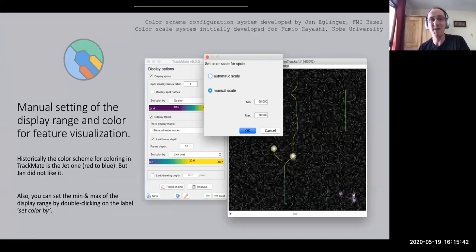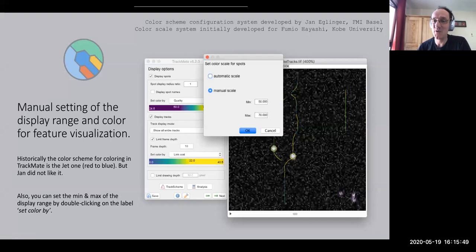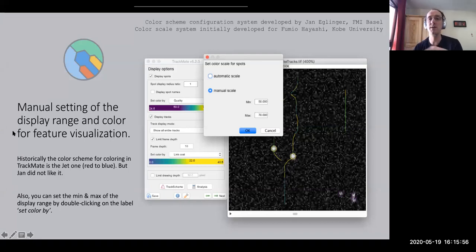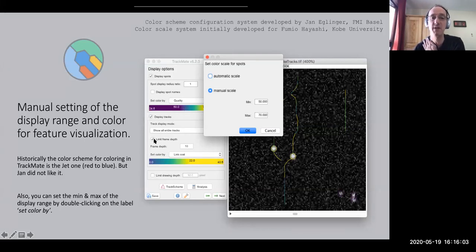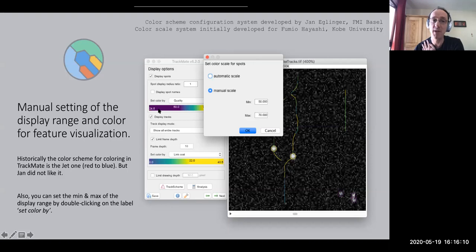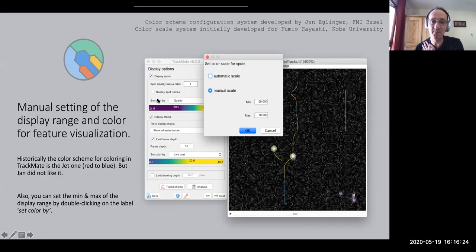Finally, the color scheme can be configured — it's the JET color scheme by default, but you can edit it in the Edit Options TrackMate menu and choose something like Viridis. What many people don't know is that you can also set a manual scale for coloring — typically the color scales from minimum to maximum feature value, but you can enter a manual scale. To bring up this window, simply double-click on 'Set color by.' This was requested by Fumio Hayashi from Kobe University.